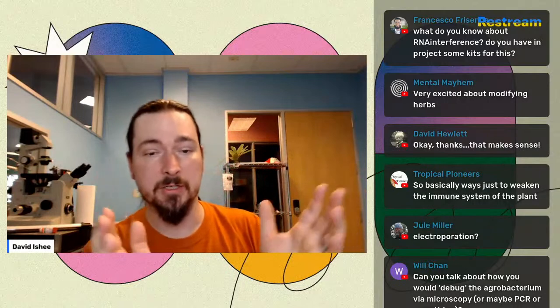So that's the virulence section. And then the last section is your payload. Your payload is just flanked by two bookended sequences that some of those virulence proteins recognize. And it's like, okay, everything between me and you is what we're going to carry across. So you don't have to keep those in one plasmid. What we're working with is actually a two plasmid system. In nature, it's one plasmid, and in the lab, it's two plasmids.